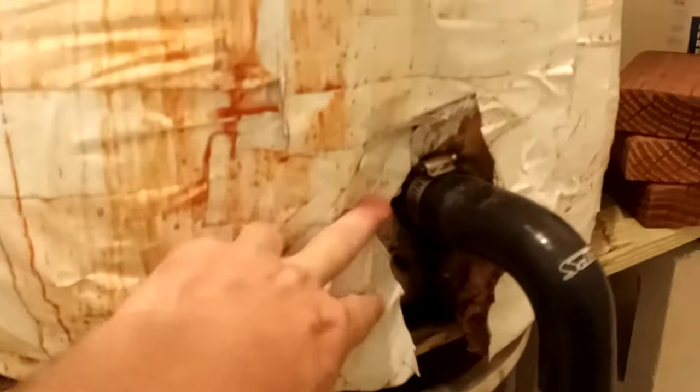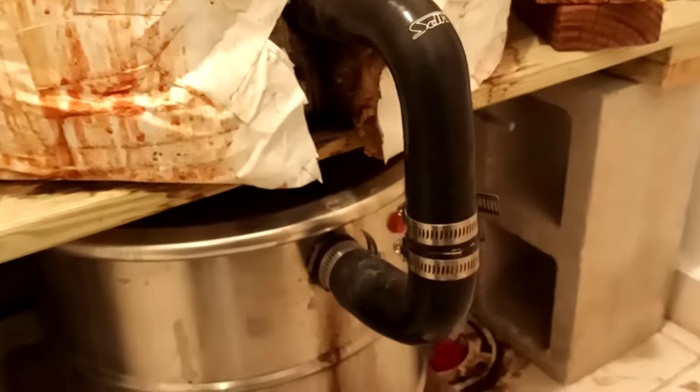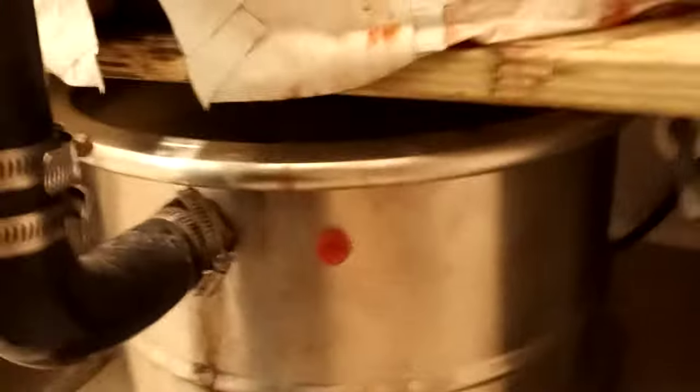The way that this port is done is pretty much just with a stainless steel bulkhead, and then we're using a tube with those same bulkheads to connect — using intercooler tube from a car turbo, essentially, is what it is.